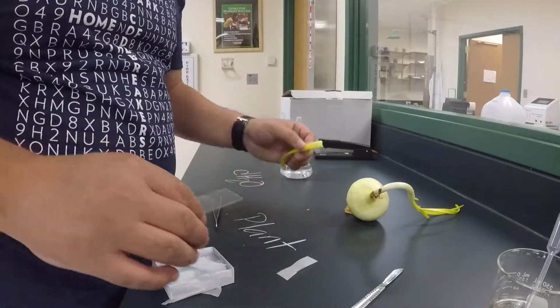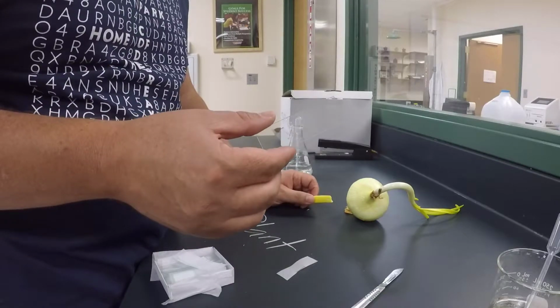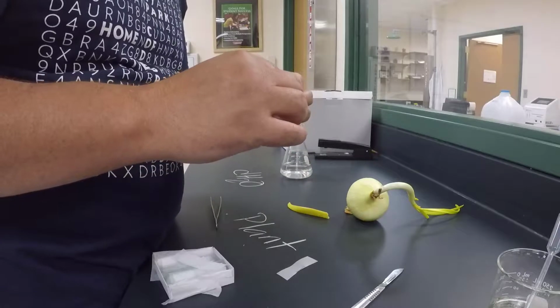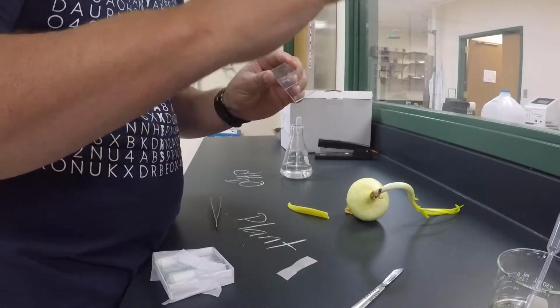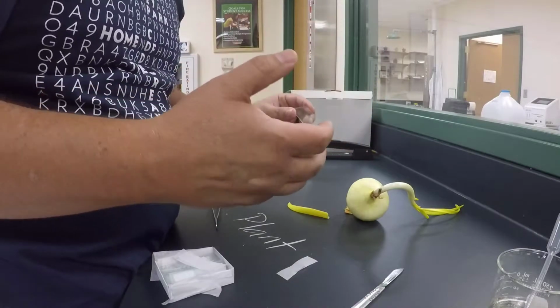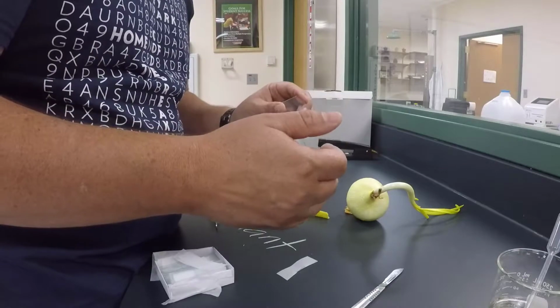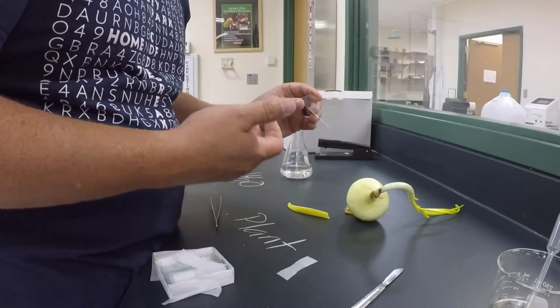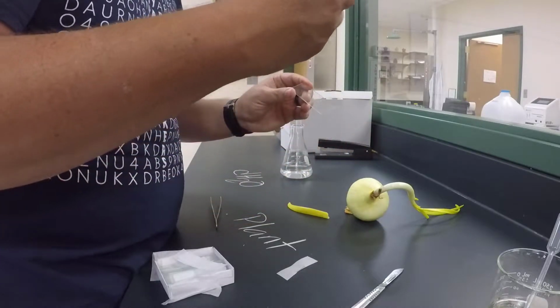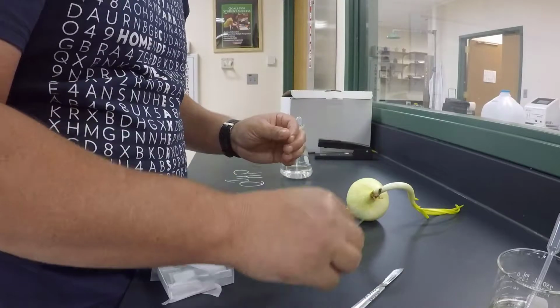It's not necessarily needed to look at it under a dissecting microscope, but by making a thin cut, now under a dissecting microscope you might be able to see the outlines of cells at 45 times your eyesight. Well, no might about it, you can. You just can't go any further than that. So you're not going to be able to see the nucleus of the cells, you're not going to be able to see chloroplasts or vacuoles or anything like that. Okay, so there's a plant.